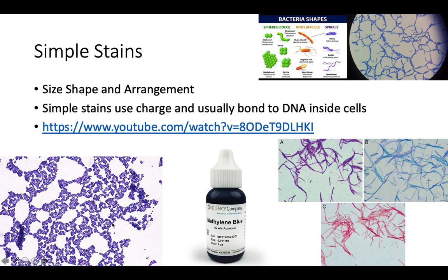How big are they? Well, you have to look at quite a few bacteria underneath the microscope to be able to judge size. You'll see here these are rod-shaped bacteria that have all been simple stained with different simple stains. They're all the same size, but if you look up here, these are also rod-shaped bacteria, and these are smaller than those. So these are also quite small. You just have to look at quite a few bacteria underneath the microscope before you can successfully judge size.